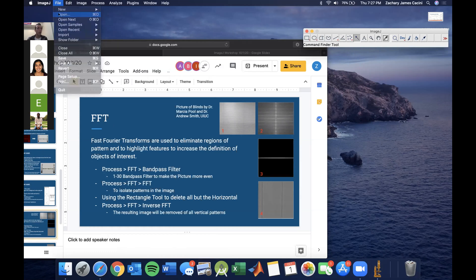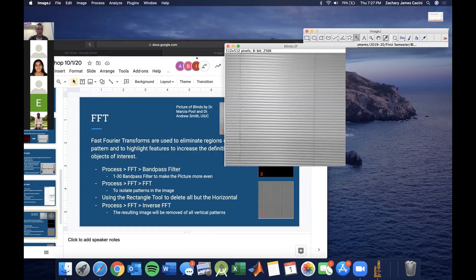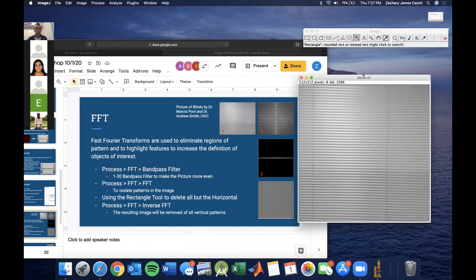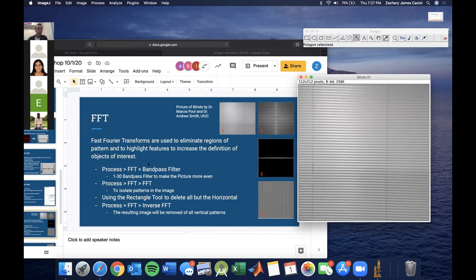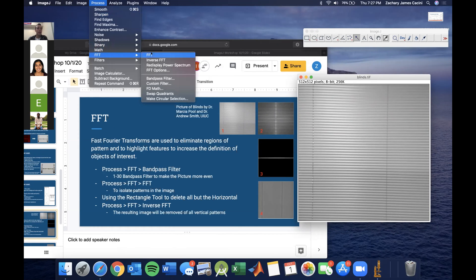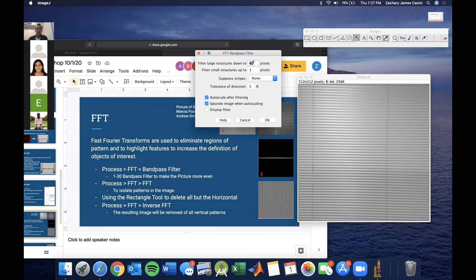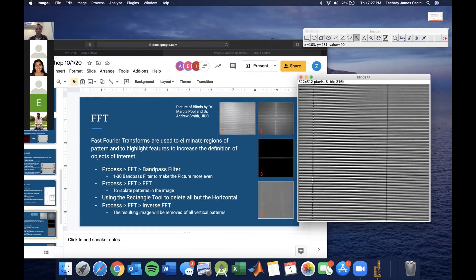File open again. It defaults to this folder since that's where I've been frequently going. I take this picture and first we're going to use a band pass filter to make the picture a little bit more even. So go to FFT, Process FFT Band Pass Filter, and set the range to 1 to 30 — just include those two lines — then hit OK. We can see the picture has been updated.